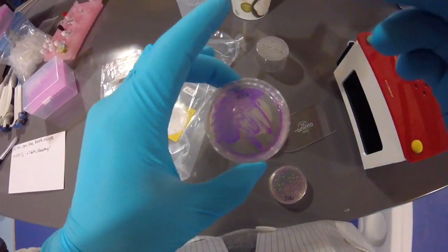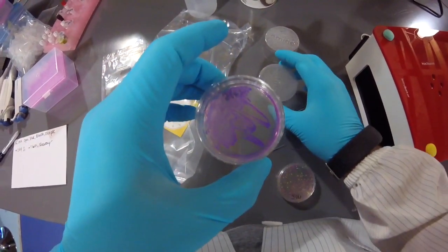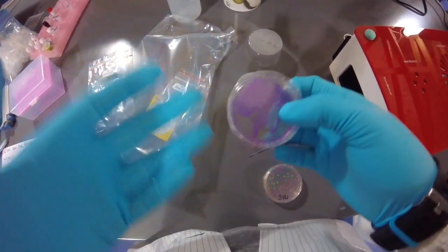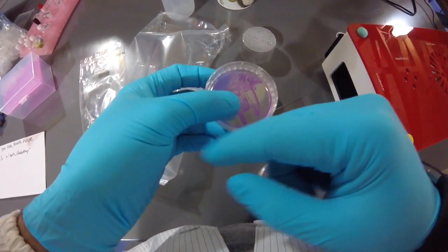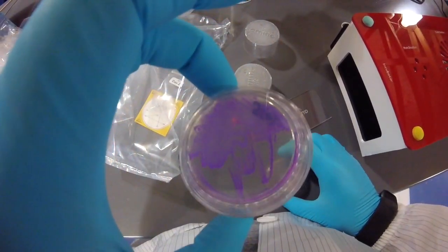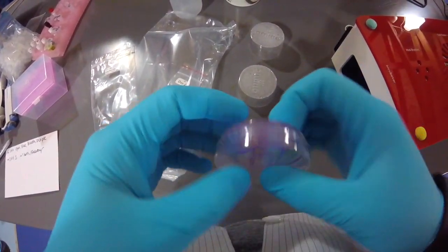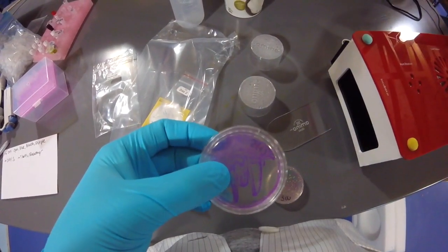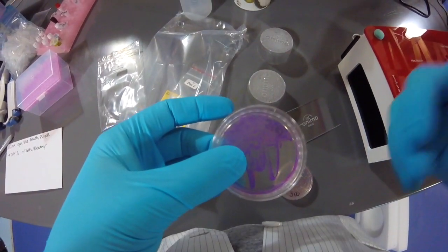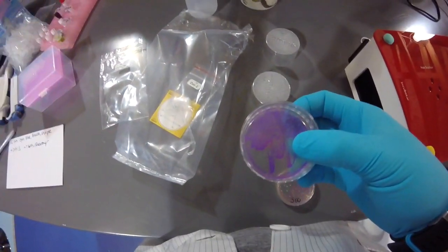All right, and that's something you need to be particularly keen to find in bioart, because if you're making bioart and you have liquid on there and you draw something, you'll get these unintentional lines of cells. Okay, so that's what positive cells look like, and positive cells could be any color. Really, the whole point is that an engineered cell that is producing that protein enzyme that breaks down the antibiotic is being expressed, and then the color trait is being expressed.